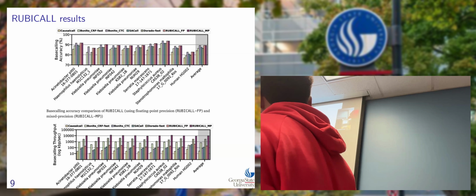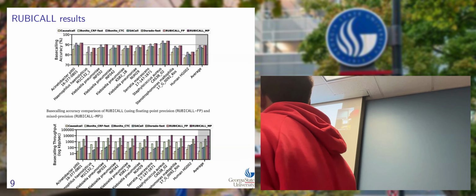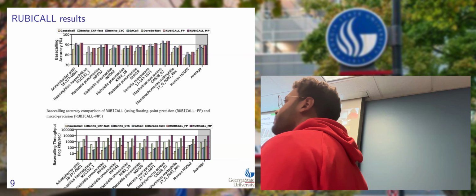Data will play a role here. The data, and the number of bits you choose for the precision, also will affect this trade-off with accuracy. This is very important. Gotcha. That's why it's a framework. It's not a single way to do it.